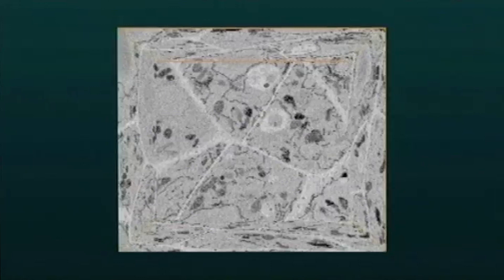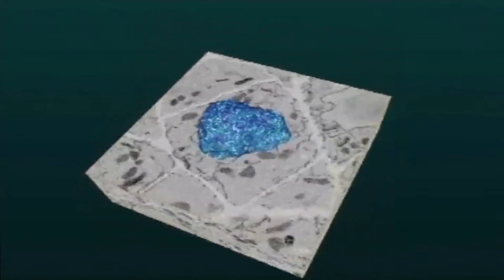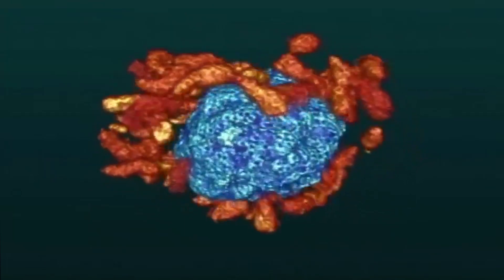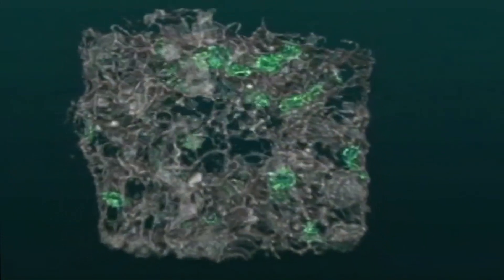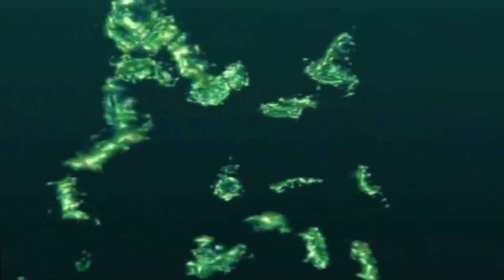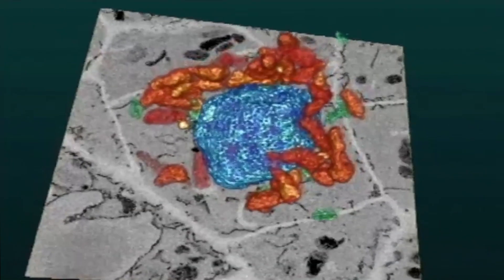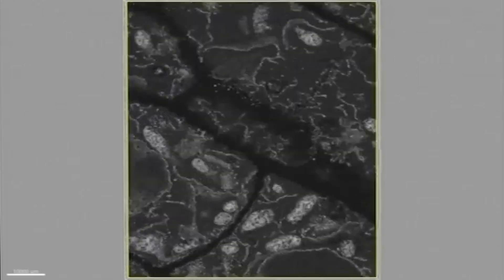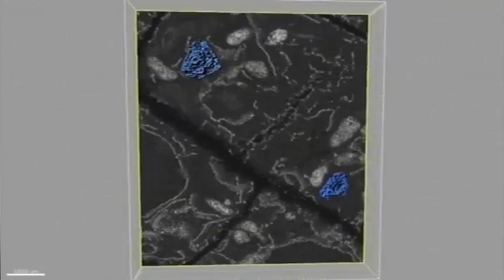This is the surface of the resin block showing cells in tobacco, and we're going through the specimen. Now we're reconstructing one of the structures — that's the nucleus in the cell. And now we're reconstructing the powerhouse of the cell around it, which are the mitochondria. And then we're reconstructing the endoplasmic reticulum, which makes proteins in the cell, and this is what we're interested in in our research. And then these little green blobs floating around everywhere are called Golgi bodies. They process proteins in your body, but they also make all the carbohydrates that you might secrete. So this is actually showing the endoplasmic reticulum where the proteins are made, and we're going through about a whole cell's depth in lots of thin slices.